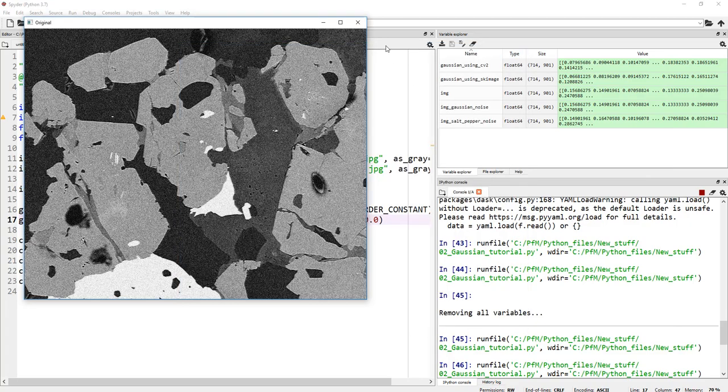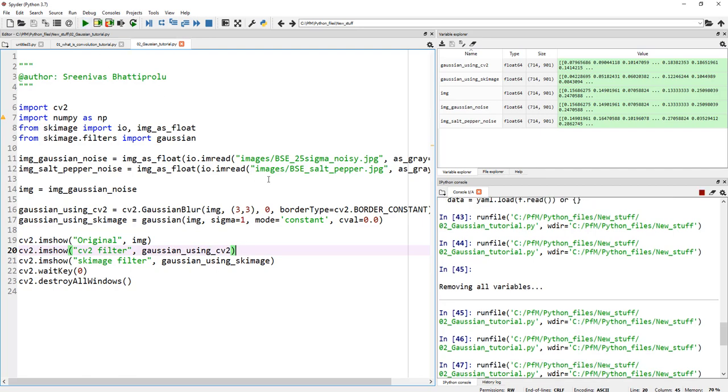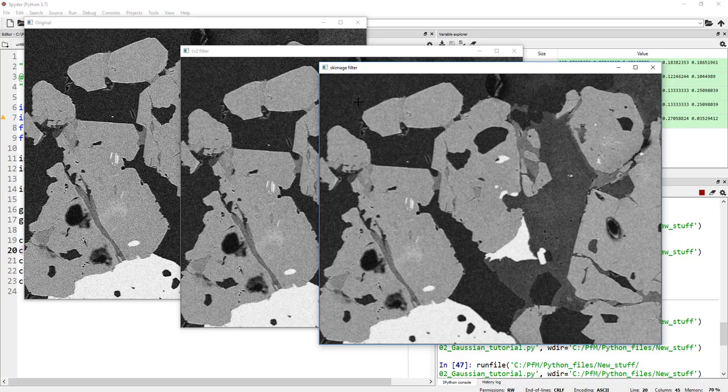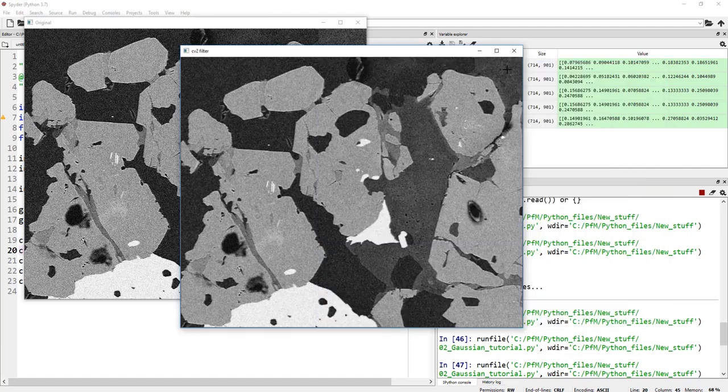Play with this. There is no right value or wrong value. Everything depends upon your image. Let's go back to sigma equals to 1 and have a quick look at this image. It did a pretty good job denoising. Not eliminate the noise completely, but you can see it did a decent job.